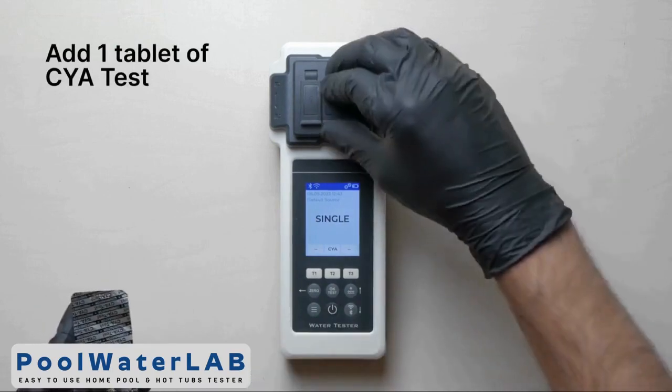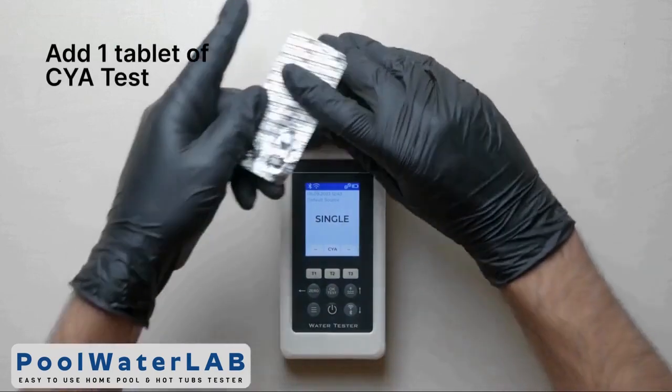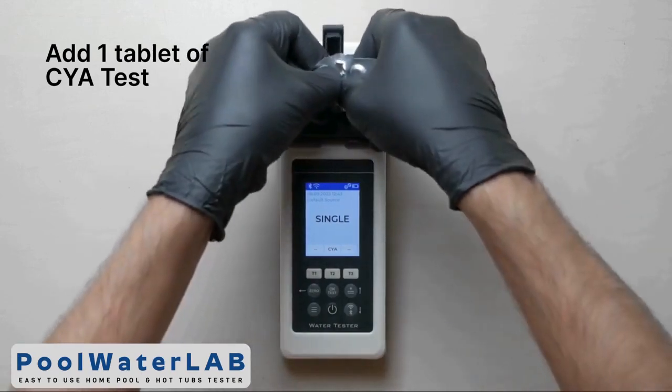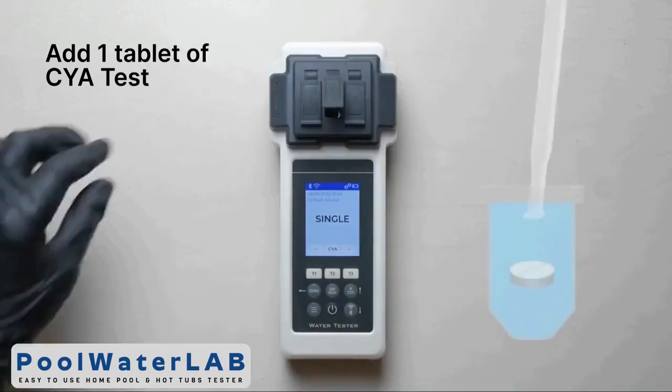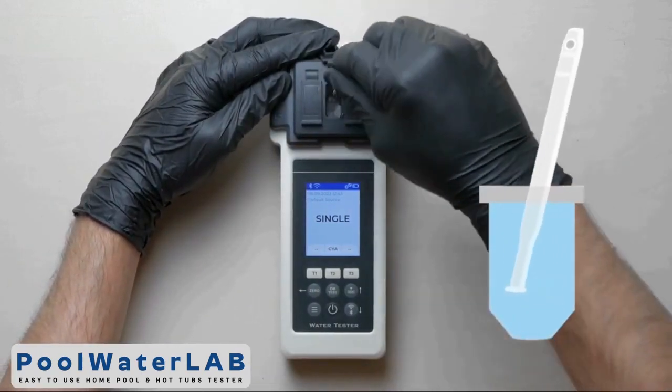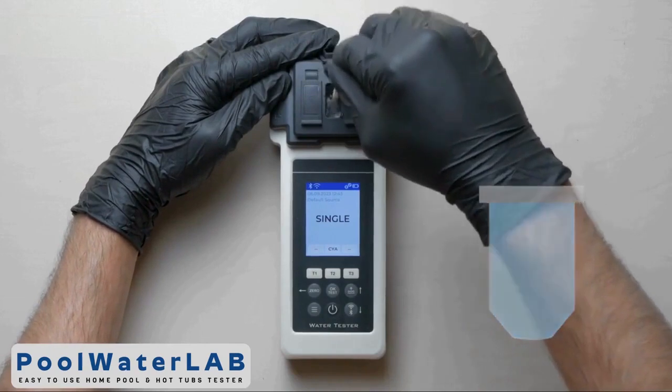Measurements of cyanuric acid are provided only in chamber number 2. Squeeze the tablet of CYA test directly into the chamber. Don't touch the tablet with your hands. Using the special stirring stick, crush and stir the tablet until it is completely dissolved.